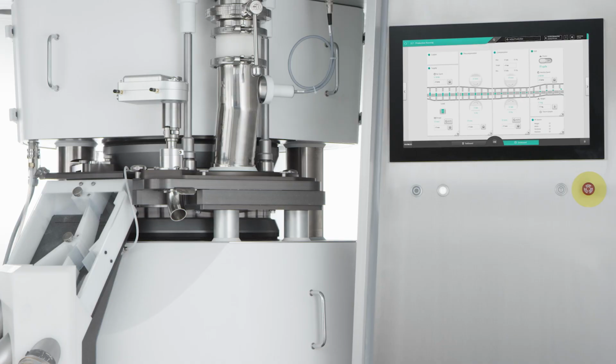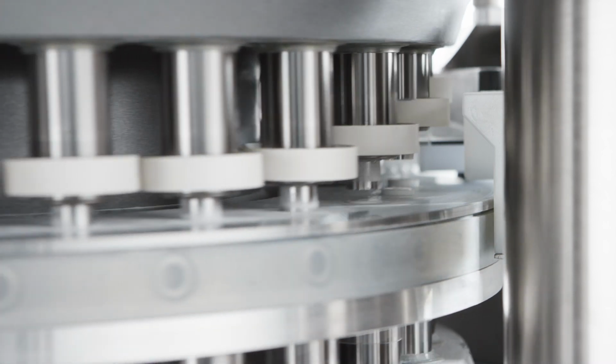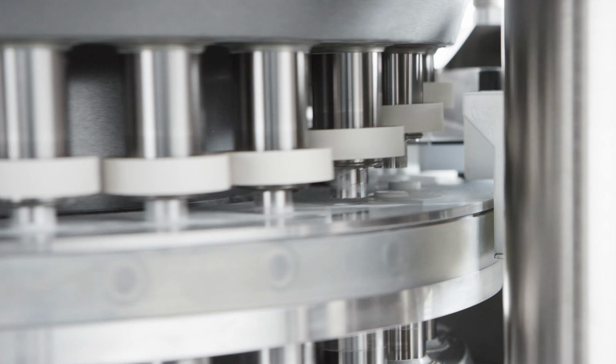Since we work in a team to mix our skills and knowledge together, we are here to introduce you how we can apply an NIR probe on a tablet press and how we can control the tableting process by using chemometrics and a quality by design approach. We decided to focus our attention on an industrial-scale rotary tablet press, model Prexima 300, installed in a continuous manufacturing line suitable for direct compression.